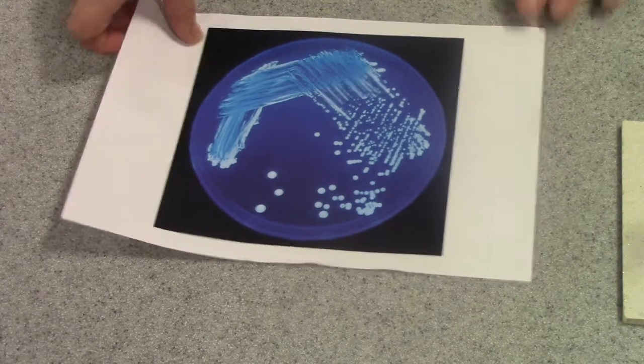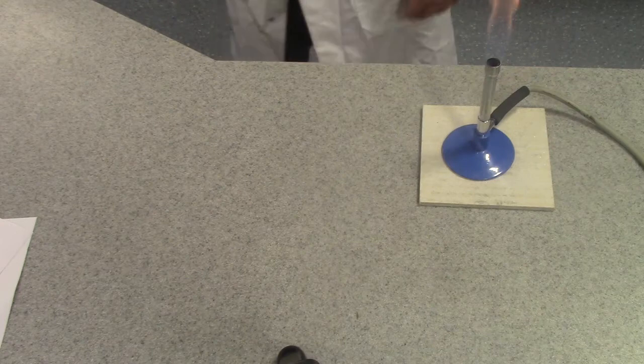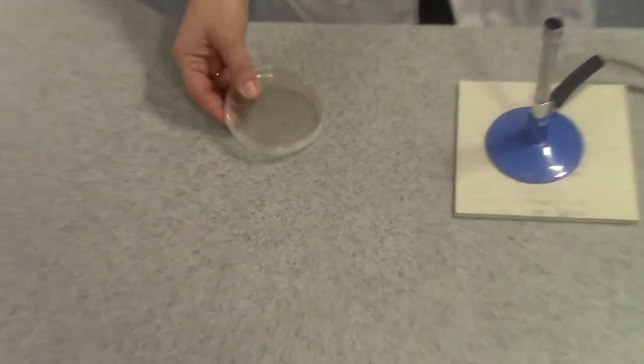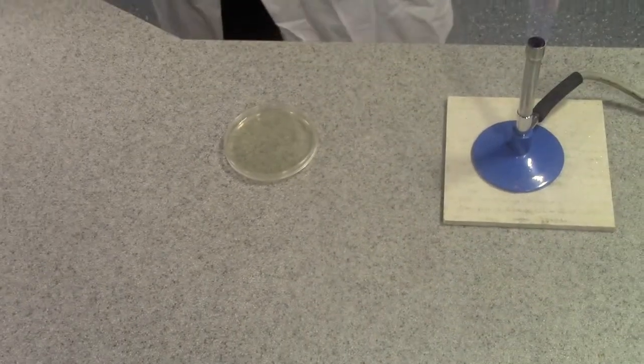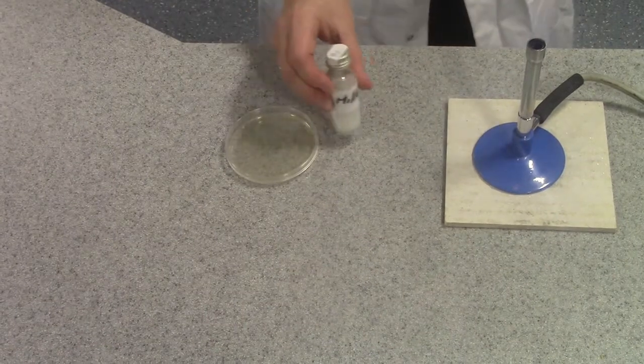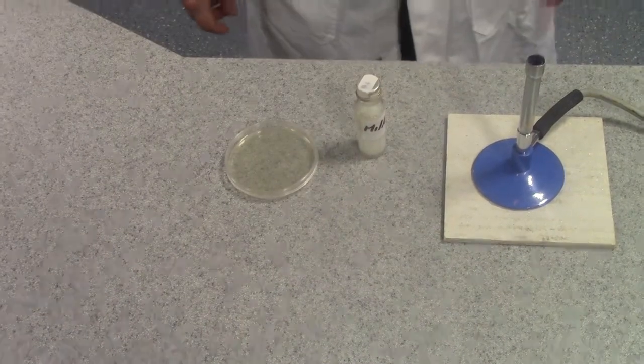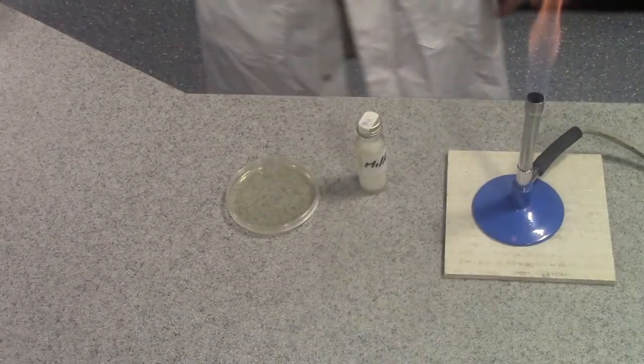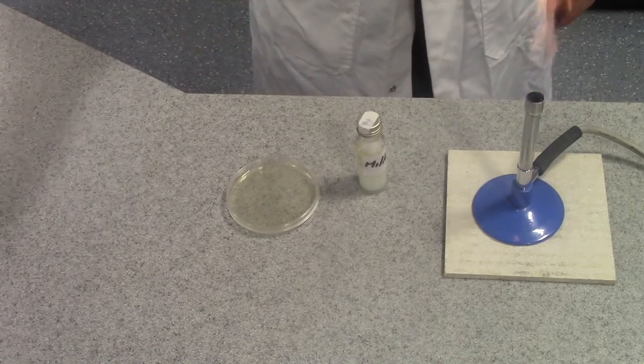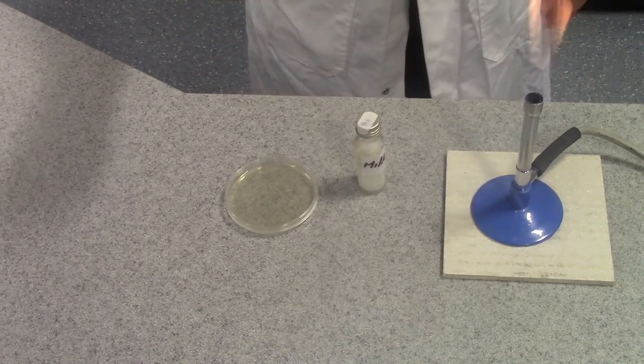Now in order to carry out this procedure, you will need a Bunsen burner, a petri dish containing nutrient agar, you'll need your sample, today I'm going to use a sample of five day old milk, and you will need a wire loop, which is a standard piece of biological apparatus.